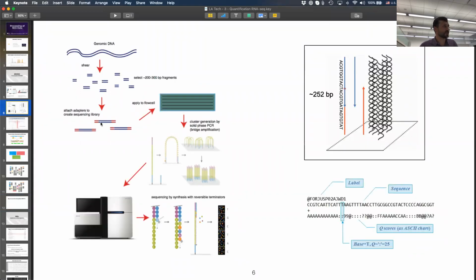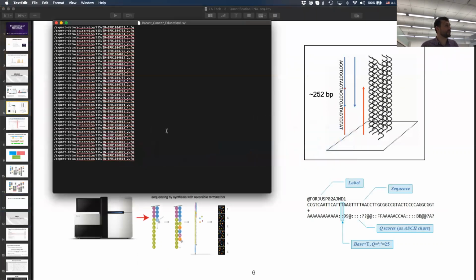Paired-end sequencing is when you have two copies of each read. One is a forward direction, one is a reverse direction, forward and backward directions. By combining those together, as you can see right here, we get a more accurate reading of each letter. So because we see that there's two files for each sample, we know that this is paired end.